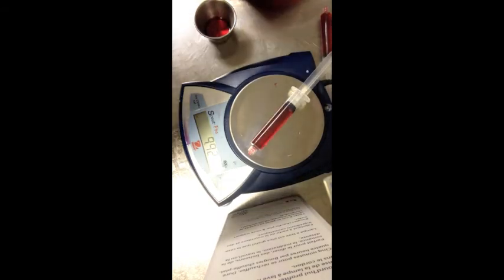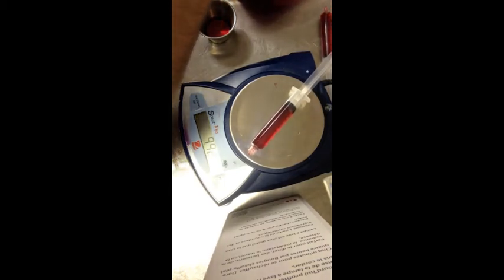So, there you go. And if we open this up, the amount of adjustment can be very fine.